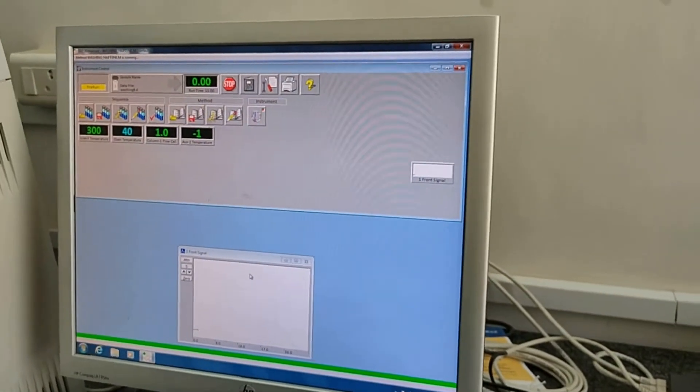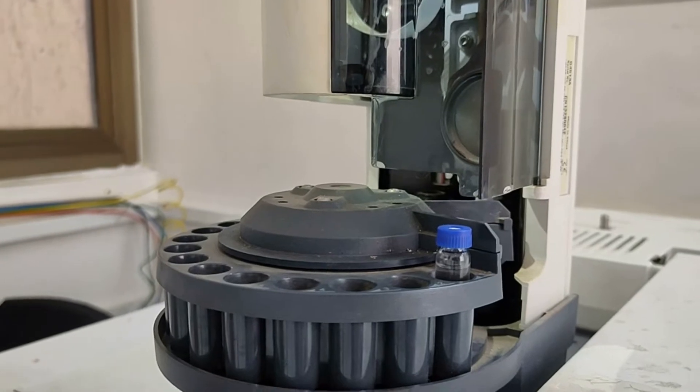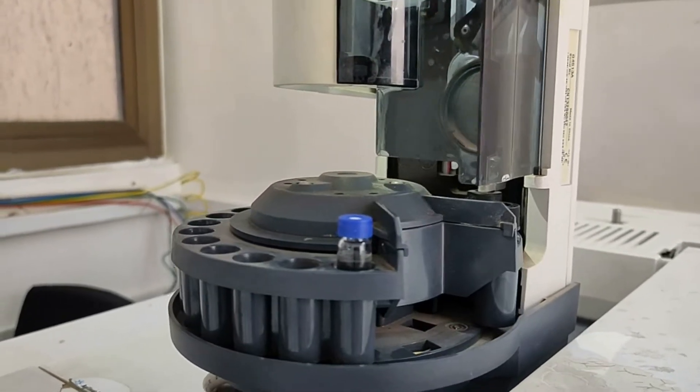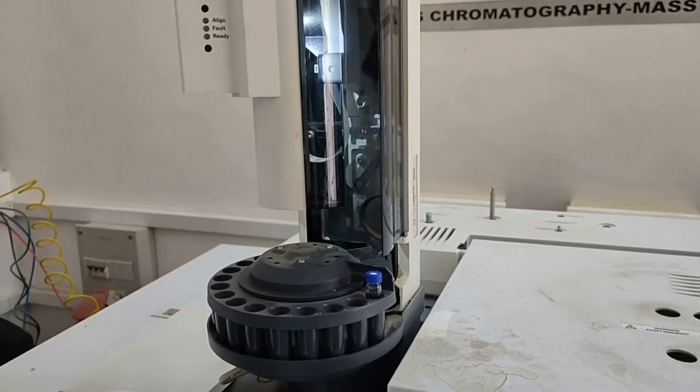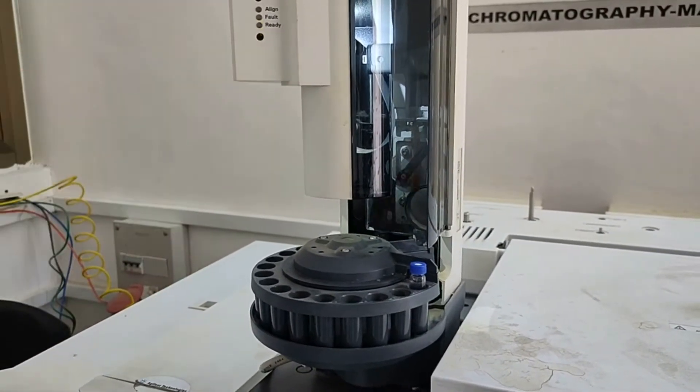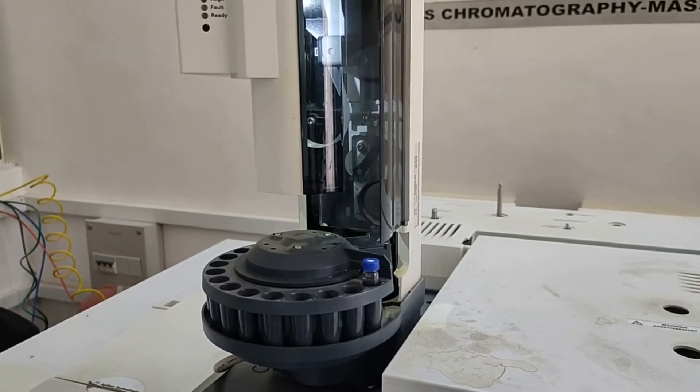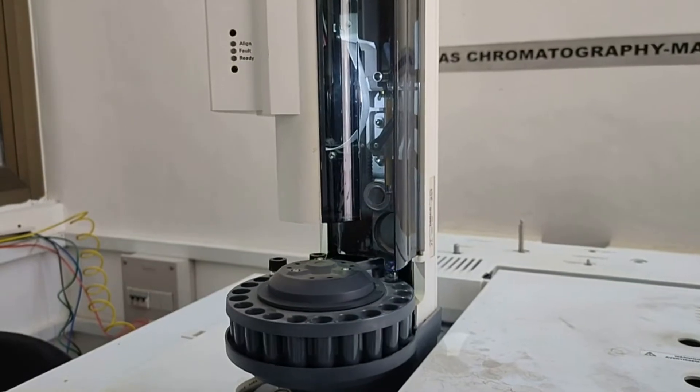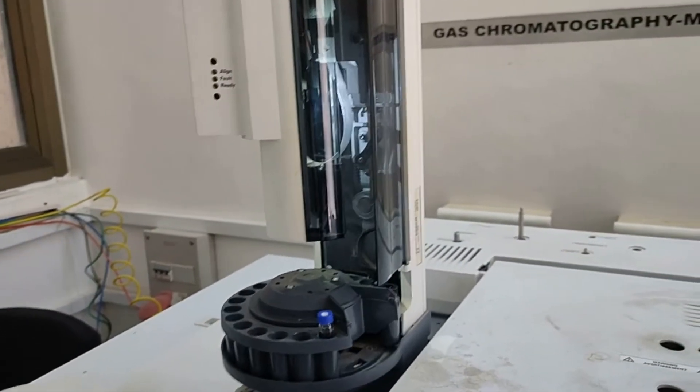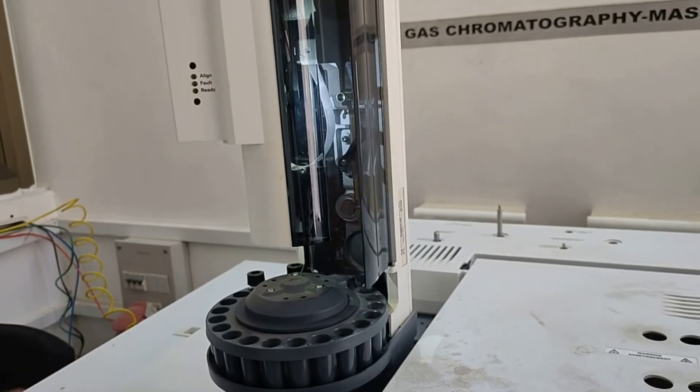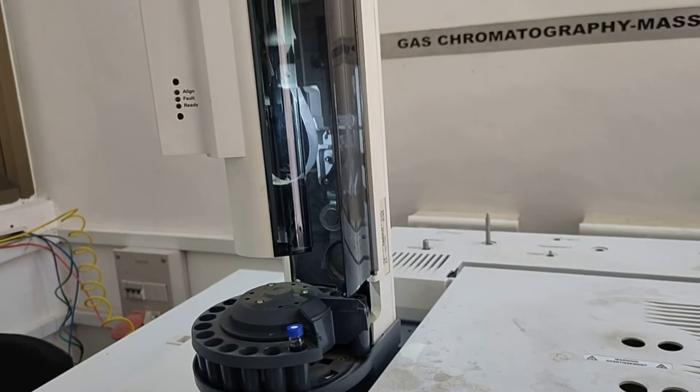Now you can see here, see here. Our program is running. First time I given the command to 5 times pumping in the solvent. So the 5 times pumping, this is the part of the washing of our injector syringe. Now after that we have given the command for 5 times, take the sample. Now take it the 5 times sample and protect the wasted column. So that finally when complete this process, when taken the final sample, so no any error coming in the syringe.